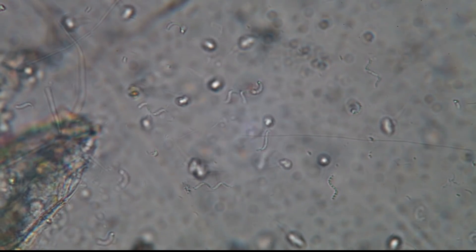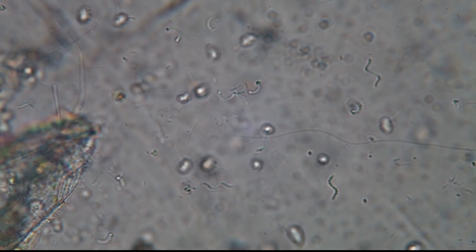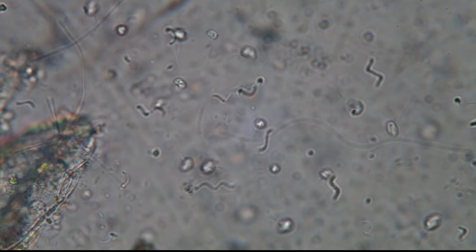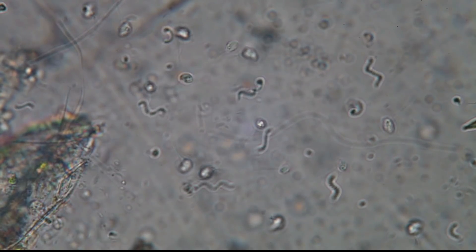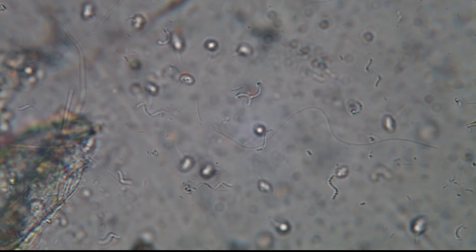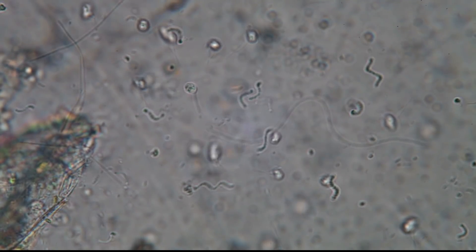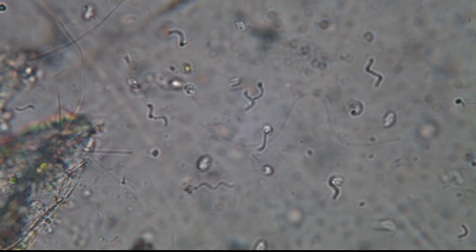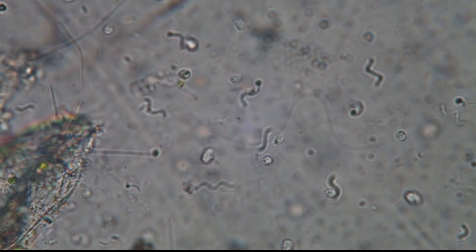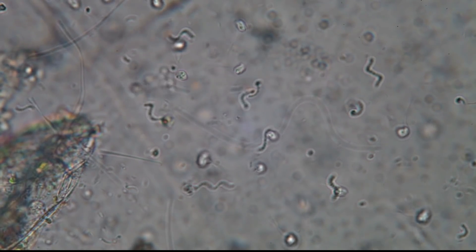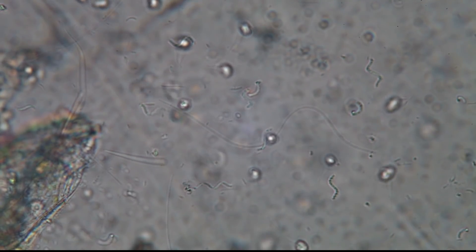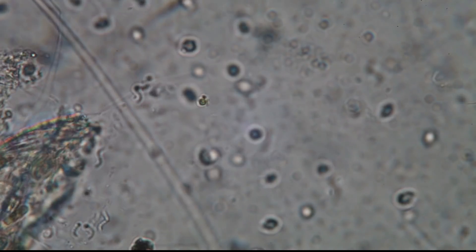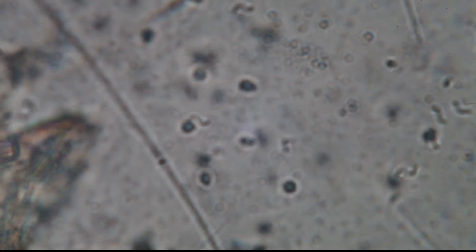And here you can also see that there are not only spiral-shaped bacteria around, but maybe you can see also occasionally very long, thin, rod-shaped bacteria. And that is basically all I wanted to show you today. You can see that the biodiversity in a drop of water is quite high and basically life and death in a water drop one might actually be able to say here. And it's quite interesting what you're able to see with a microscope.